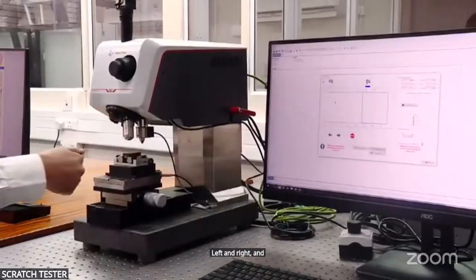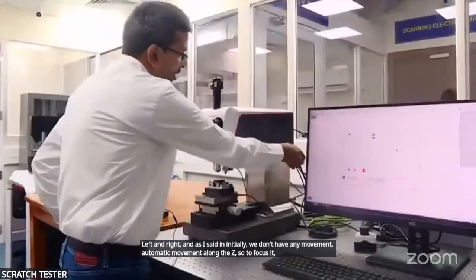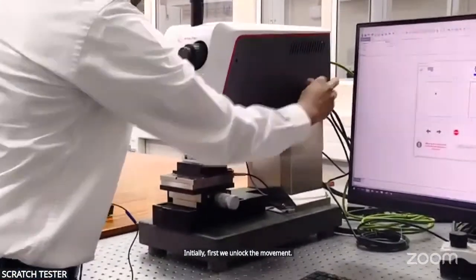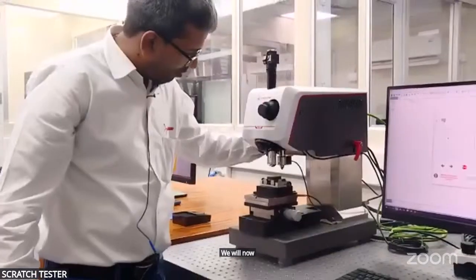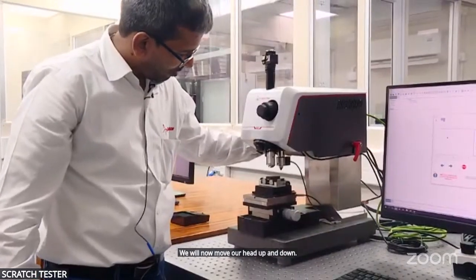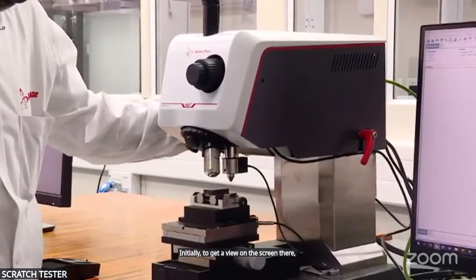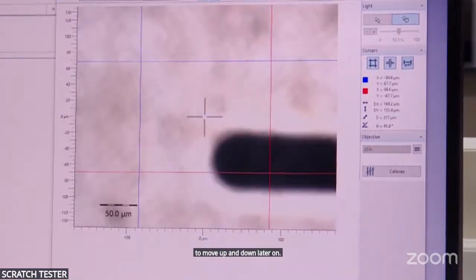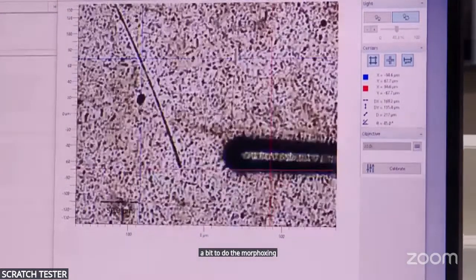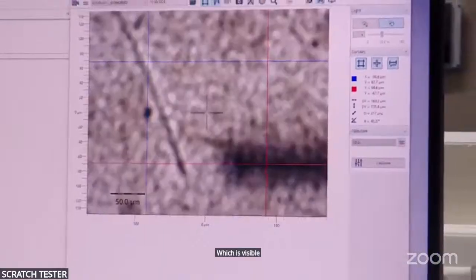As I said initially, we don't have any automatic movement along Z. To focus, first we unlock the movement, so we open this knurled screw. Then from the side, we move our head up and down initially to get a view on the screen. I'll go a bit beyond the focusing point so that I have leverage to move up and down later to do more focusing. You can see the sample initially had some pre-scratch, which is visible. Now I'm a bit out of focus.